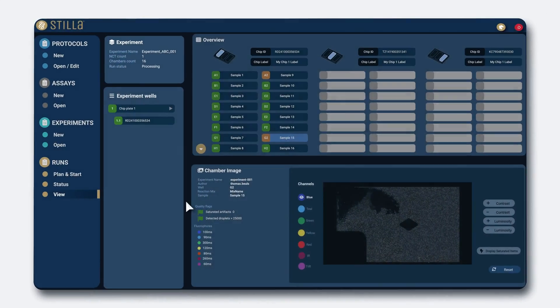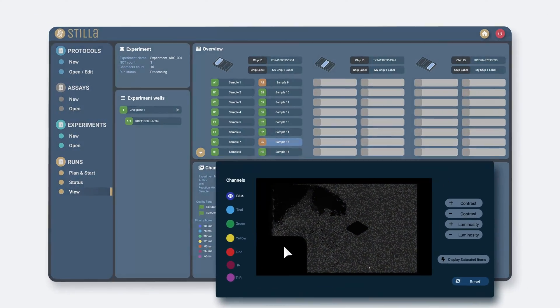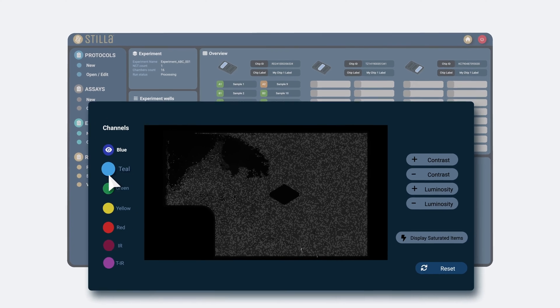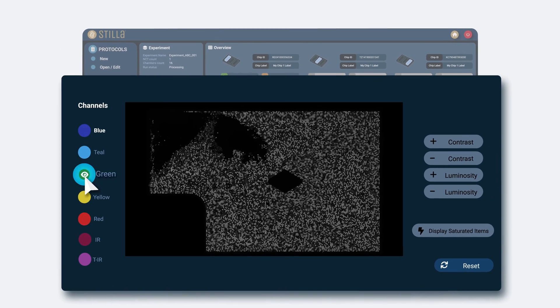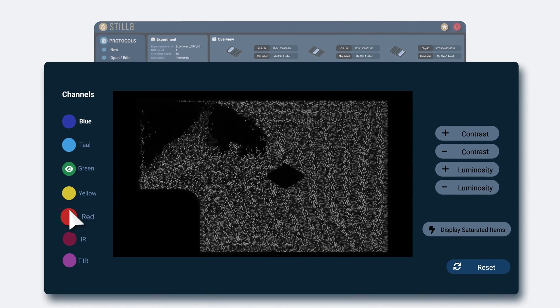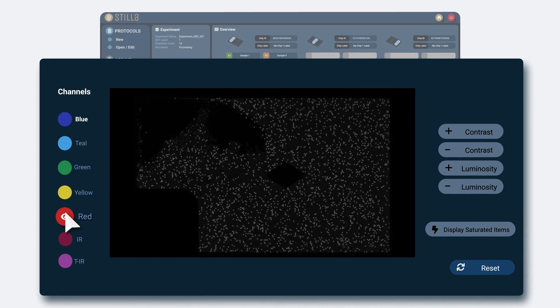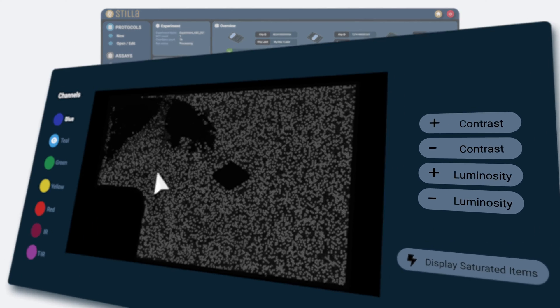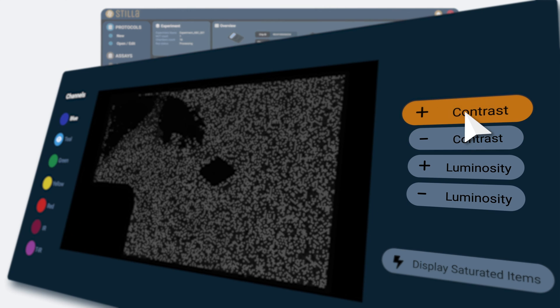And when NIYO Plus is done, it immediately runs automated QC checks, right on the instrument, giving you the control you need, exactly where you need it.